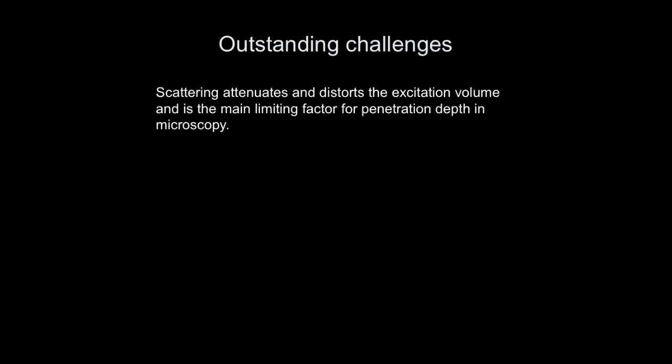And that is very unfortunate, because the contrast that we have is beautiful, it's label-free, it's very fast, but scattering perturbs the focus, and therefore we cannot generate enough photons. We can't get them out, right? So scattering is really the limiting factor in nonlinear optical microscopy. So it's worthwhile thinking about this. If you can solve this problem or even make it remotely better, you actually gain a lot, right? If you can get down to 500 microns, you actually will have a lot of new friends, I can tell you that.